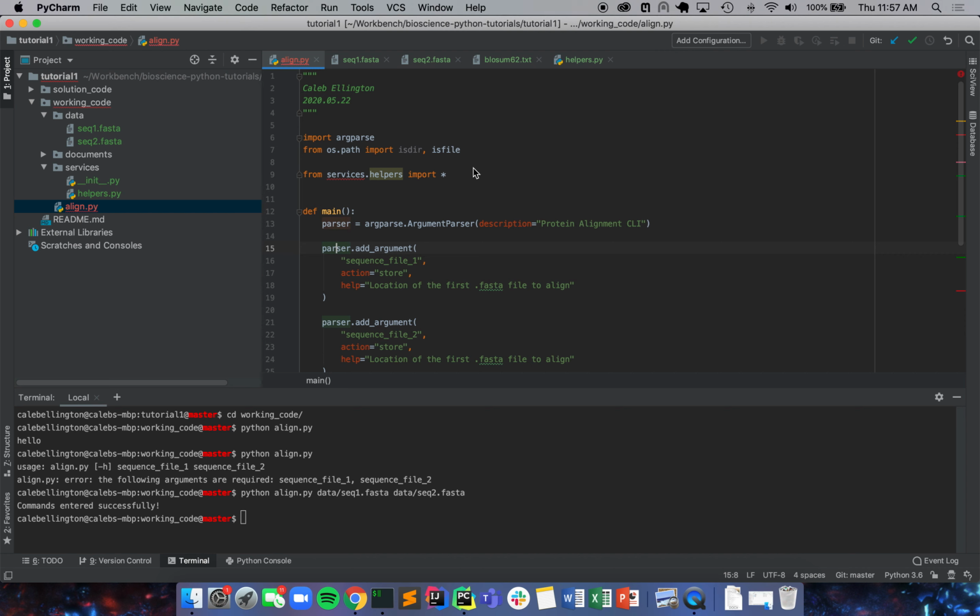And then what we're going to do is, sorry about that. Right. Yeah, we actually don't even need this services. I was wondering why I was having that weird sort of issue. Result reference to helpers. Okay. Yeah, whatever, it'll be fine.